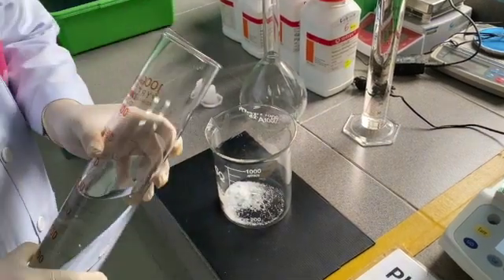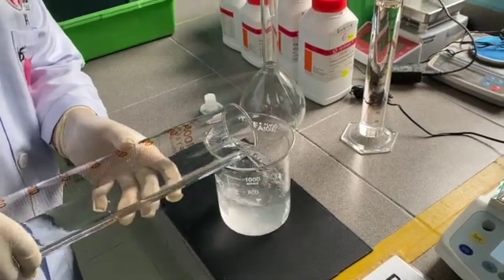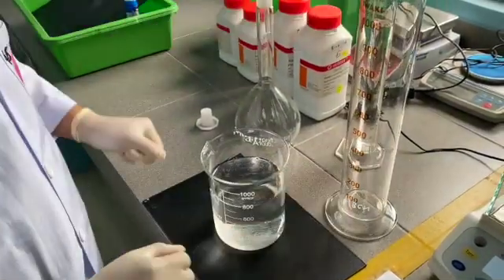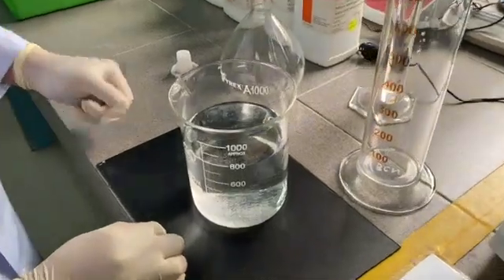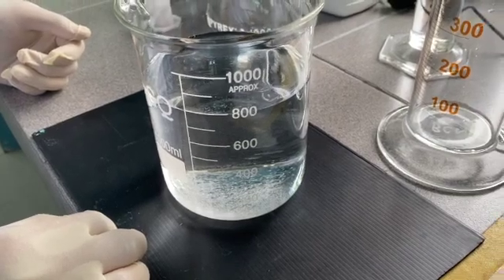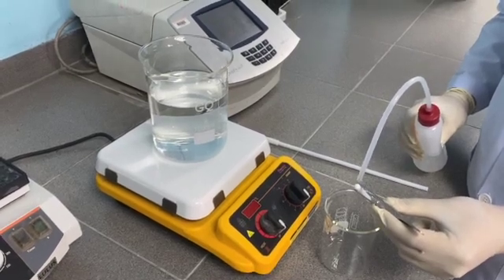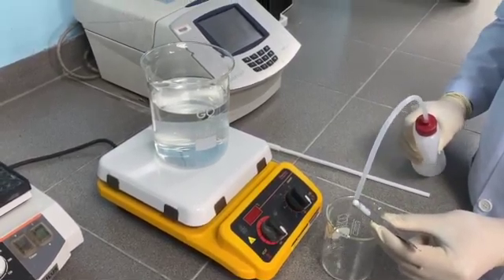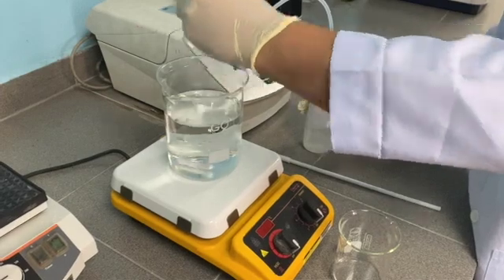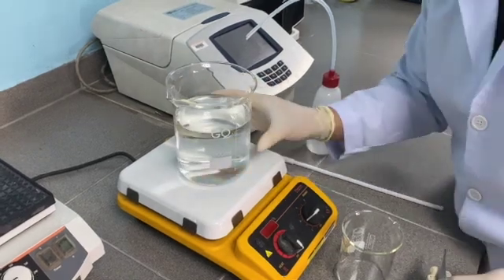Salts will be dissolved with distilled water. As we can see, the salts contain aggregates that do not dissolve. Therefore, we will mix them using a magnetic stirring bar. We will rinse the magnetic stirring bar with distilled water first before adding it into the beaker. The magnetic stirring bar will stir the salt until it dissolves.